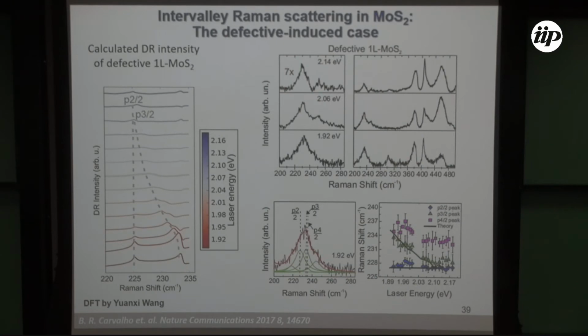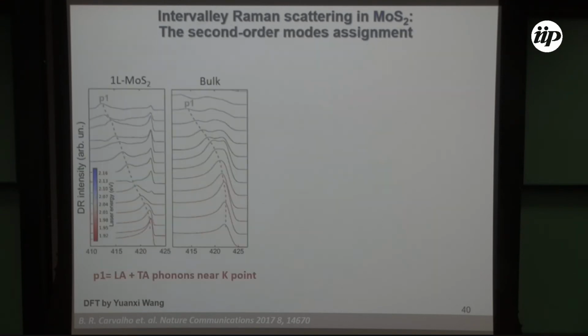We did the calculations and also the experiment for a defect band. We took a monolayer MoS2 single layer irradiated to create defects, and we were able to see the frequency of this band, which is over here, the LA band, like a D band in graphene. We did all the procedures and measurements as well, and we got the same results, matching the calculation, to check the consistency of the work and see whether our explanation made sense, and it did.